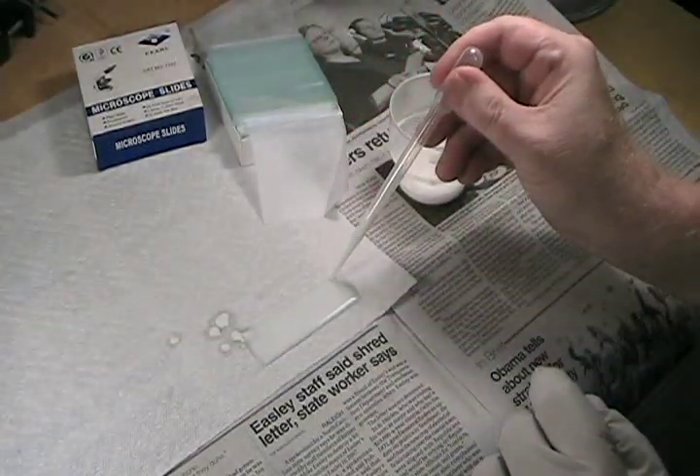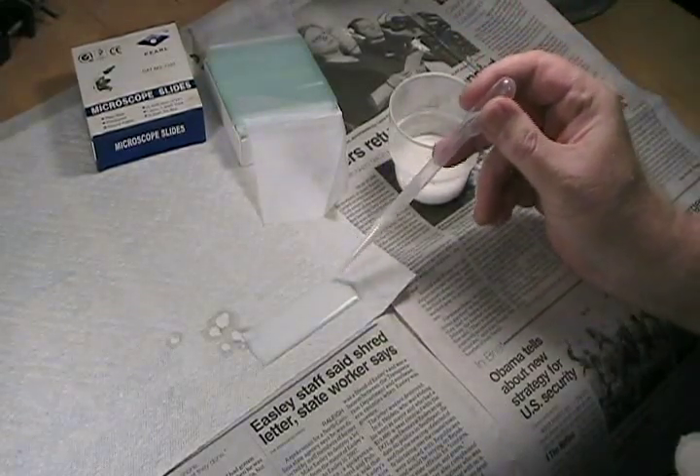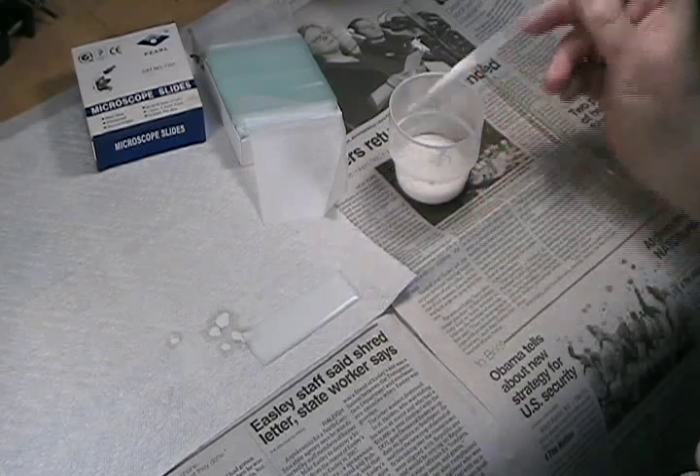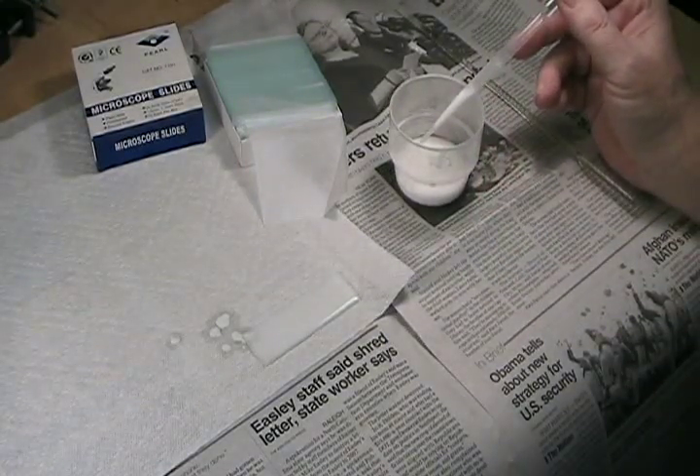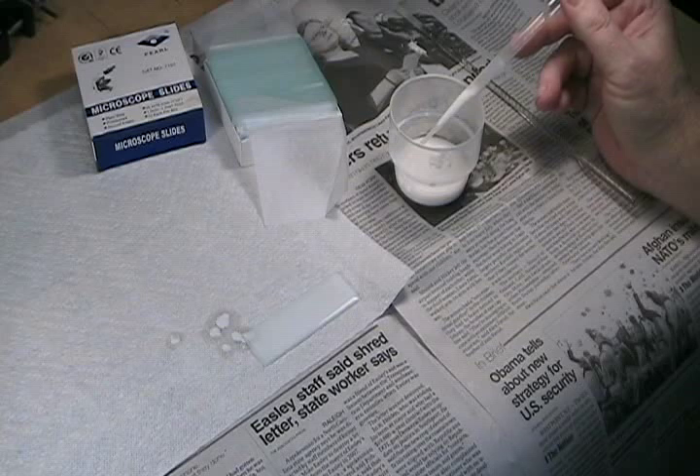Make sure you don't have any bubbles. Once the slurry is mixed, you have about two minutes to work before it hardens. Once you get used to this, you can do a slide about every five seconds when you're in production mode — that's usually about two dozen slides over the course of two minutes. Making TLC plates can be pretty messy, but TLC plates can be stored indefinitely, so you'll probably want to make up a good supply each time. I generally do batches of a couple dozen slides.